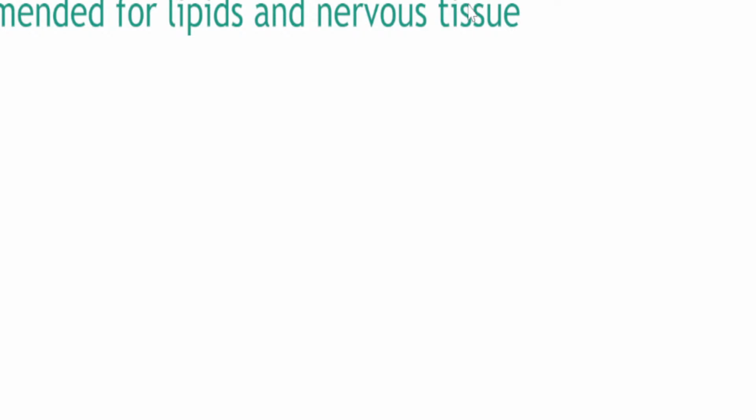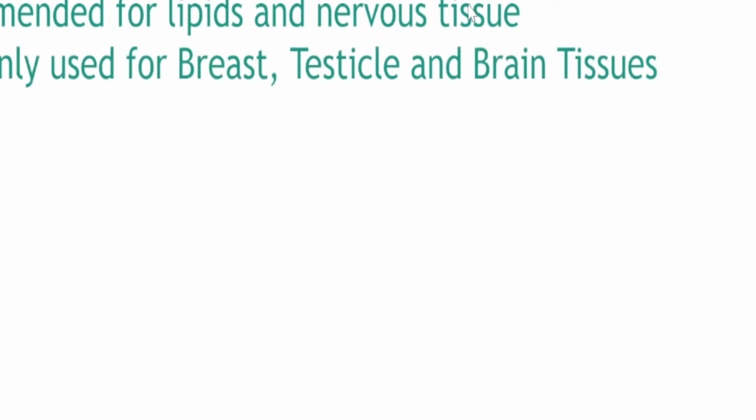Next, it's recommended for lipid and nervous tissue. You'll see why later. And it's mainly used for breast, testicle, and brain tissues. Breast, testicle, and brain tissues.